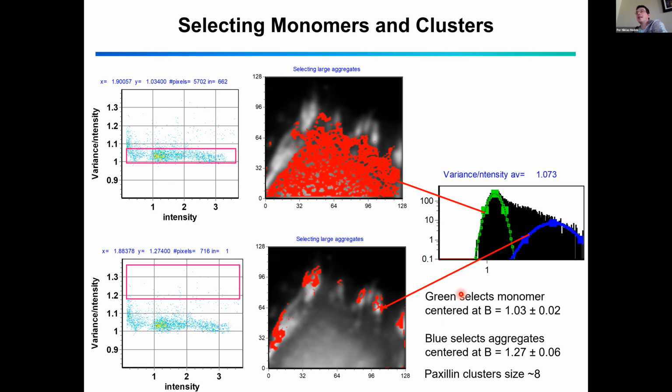So why is this? Well, the reason is that once the adhesions are formed, the Paxillin molecules don't move around anymore. They stay in the same spot in the adhesion until the adhesion is disassembled, for example. However, while they are incorporated in the adhesion, the oligomerization is increased and further increased. So at the edges of the focal adhesions, you have these higher-order complexes forming, but also disassembling.